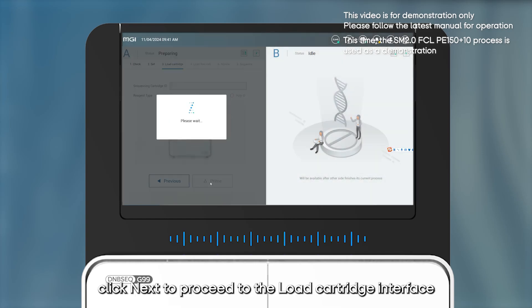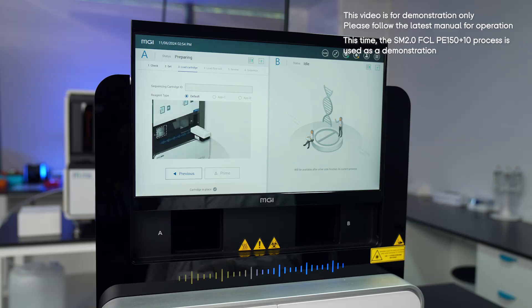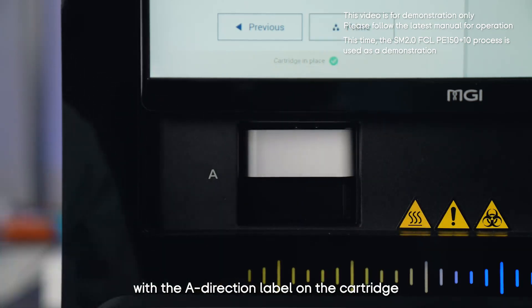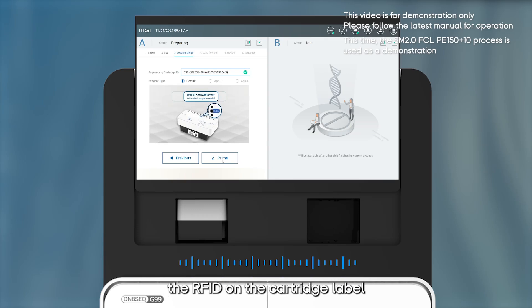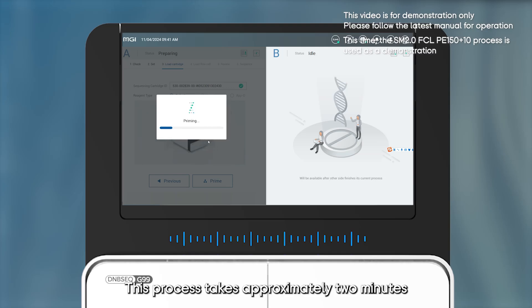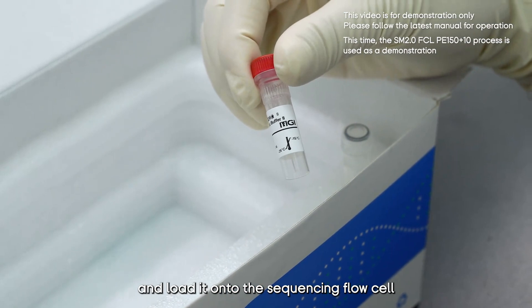In the advanced settings, select Yes for both Split Barcode and Auto Wash. After confirming all information is correct, click Next to proceed to the Load Cartridge interface. The screen will automatically rise revealing the reagent compartment. Insert the prepared sequencing reagent cartridge into the A side reagent compartment, aligning it with the A direction label and pushing it all the way in. The system will automatically scan the RFID on the cartridge label and fill in the cartridge information in the UI software. Click Prime and the instrument will start the pre-loading process, which takes approximately two minutes.